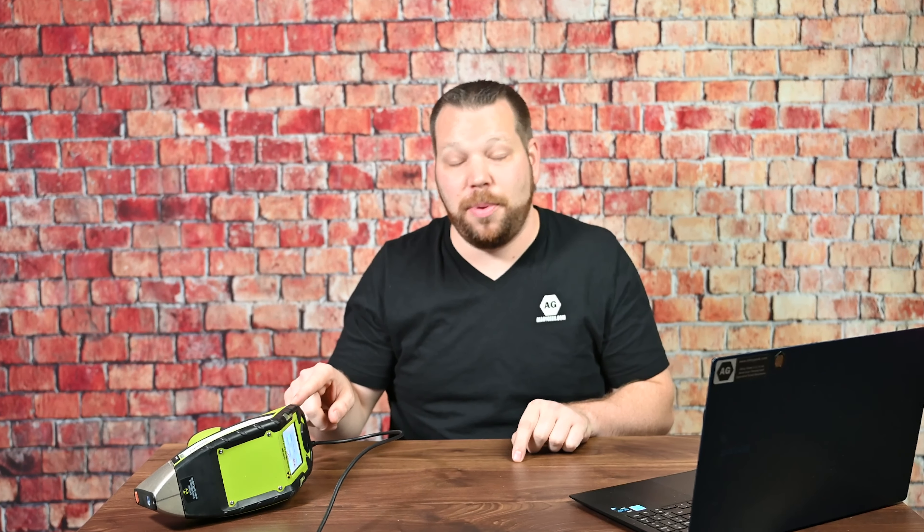Hi, I'm the Alloy Geek and in this episode we're going to talk about how to take the data from your Niton XL2 Plus and get it onto your computer. That's a really important step for many of you out there and there are a couple of small hang-ups you could be running into, but we're going to go over those today so let's get into it.